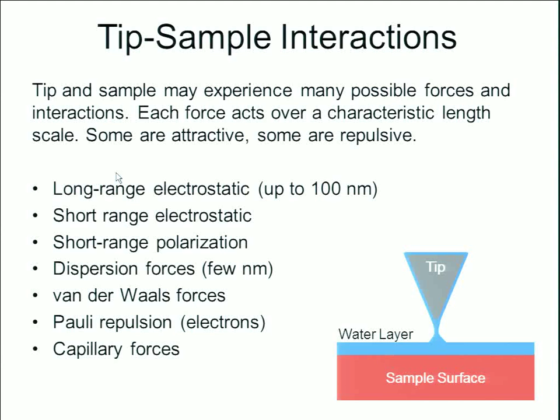The tip and sample may experience many forces. Each force will act over its characteristic length scale, and some will be attractive and some will be repulsive. Again, some of them may be long-range or short-range electrostatics. There could be short-range polarization. Dispersion forces may play a role within a few nanometers. There'll be van der Waals forces at very close distances.